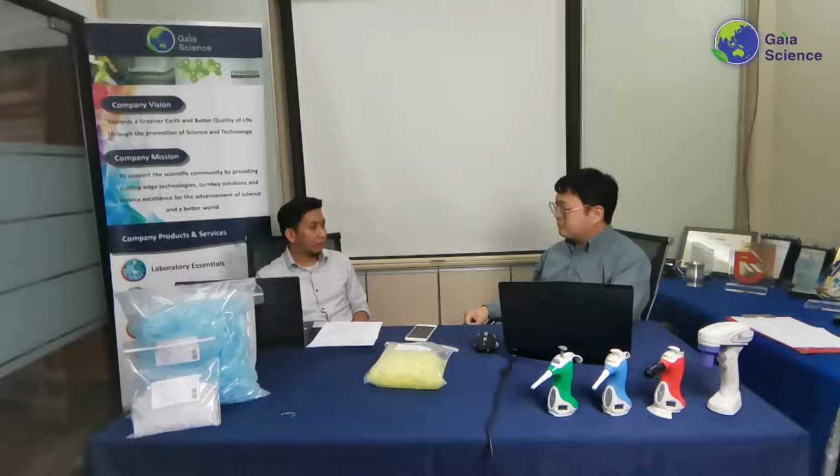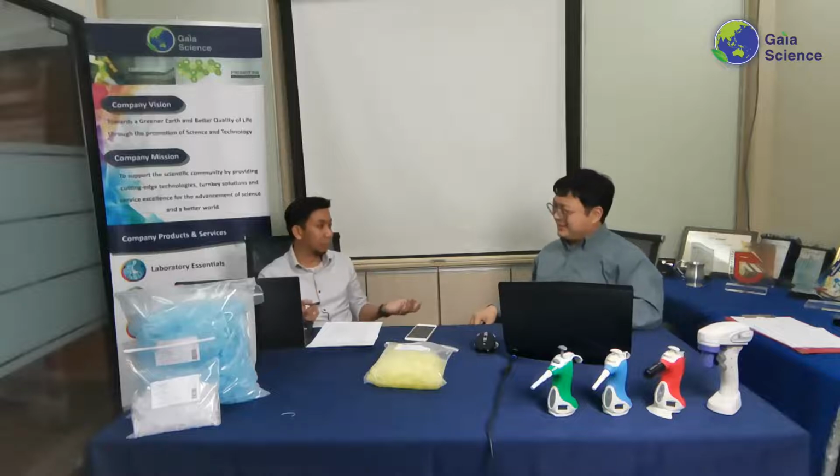Same with tips. If the tips are able to fit and you like them, and they match your requirements, it doesn't matter whether it's a research lab or a GMP certified lab. Then I think you're fine. It doesn't matter whether it's made in USA, England, China, or Malaysia. As long as it works as it's supposed to, then why not.